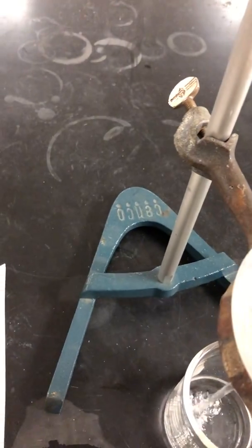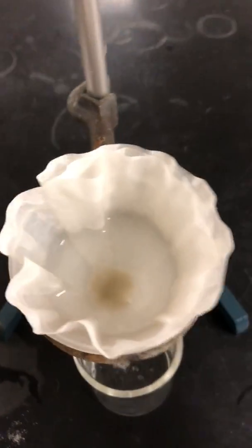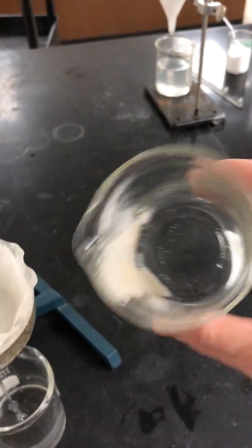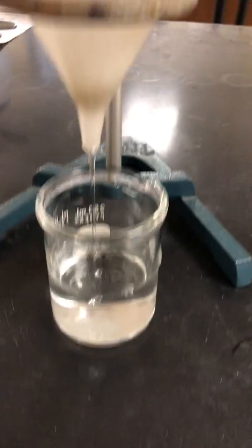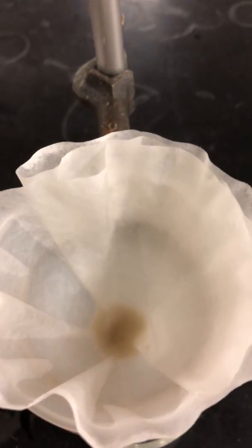Okay, we're pouring this in. Did not get all the sand, but I got some. So that's enough. Like, I am going to see the results of this and get the answer I need. So I'm not worried about this. Just wipe that out into the trash can. Okay, we're waiting. And really, I'm seeing the water go through. The sand is not. So I have a solid that did not dissolve, and the filter paper is catching it. Okay, good. Did I think the filtration would separate the sand from the water, and why? And you will answer that.